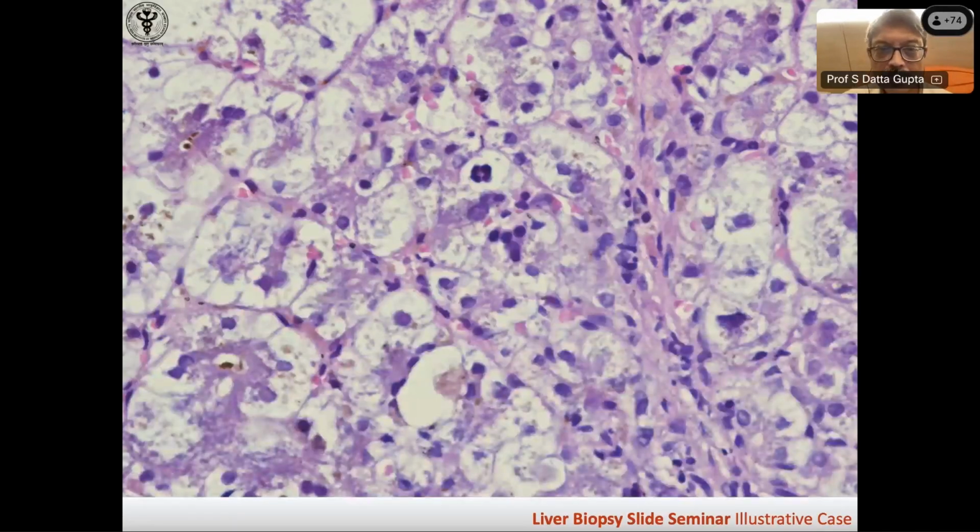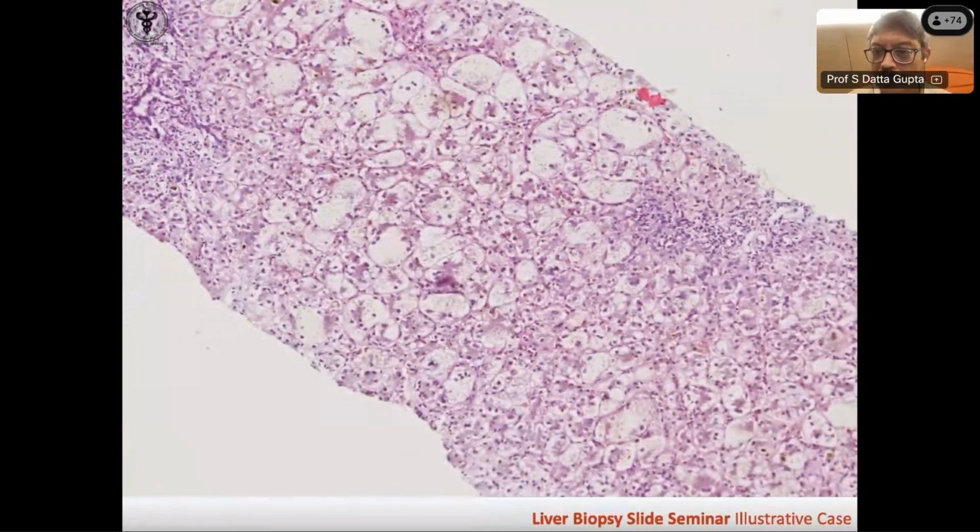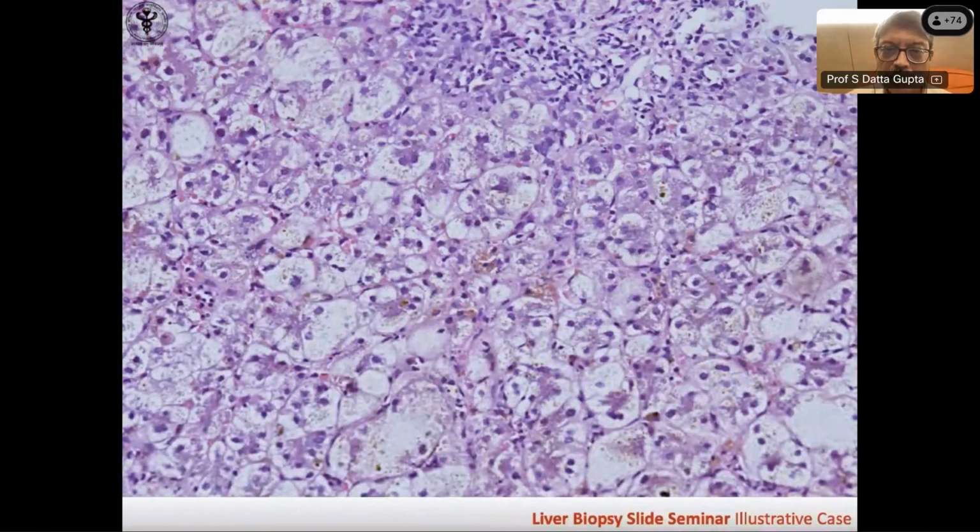Now let's go back. You see, this is a diffuse disease with diffuse ballooning. This is an acute hepatitis with cholestasis and all. The only pointer to neonatal hepatitis would be if you find some normoblast that was suspicious there, and of course multiple nuclei. I told you up to old age you can get 2 nuclei, no, because of the polyploidy and other things. If you find 3 or more nuclei in an enlarged cell, it is called a giant cell or giant hepatocyte, and that is common in the neonatal period. You can get it in adults.